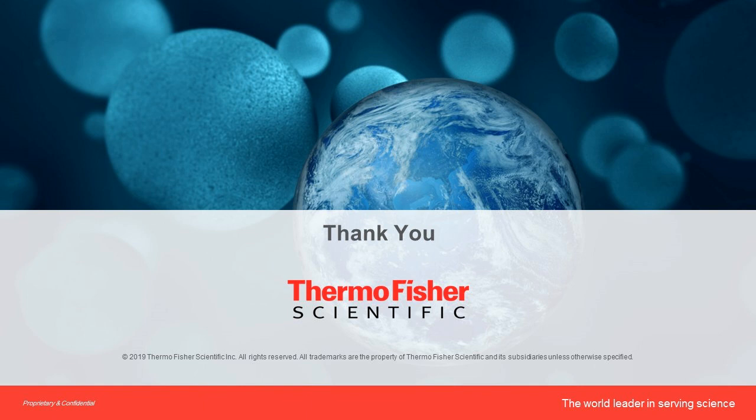Really depends on stability of, for example, the AAV particle, and there have been some examples of polishing using HIC. Of course, you need really high concentrations to bind the particle to the HIC. And again, I think I've shown in this webinar that, for example, MVM is actually a very hydrophilic virus particle, and by extension, since AAV also is part of a virus family, we expect the hydrophobicity ranges to be similarly less hydrophobic. So really depends, I think, on the process you're trying to design here.